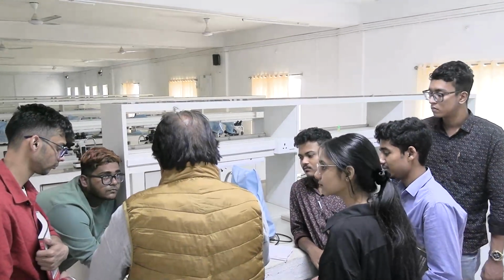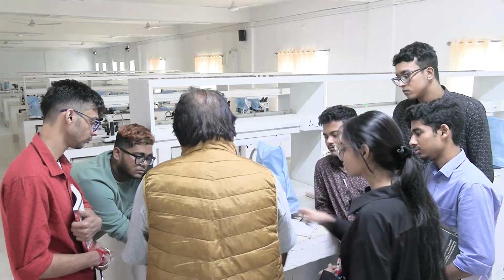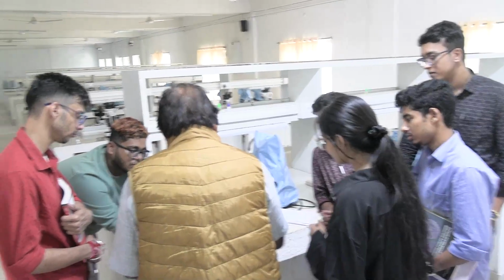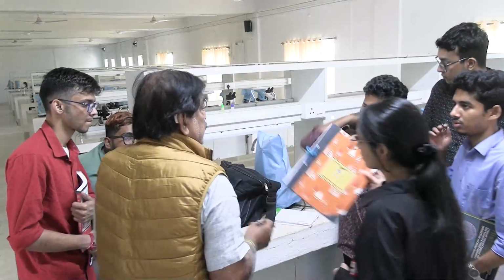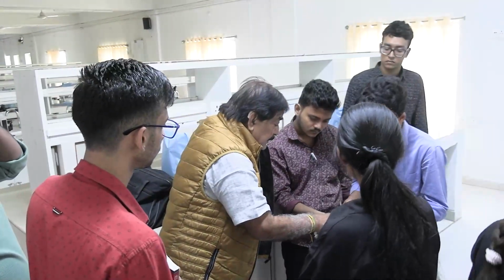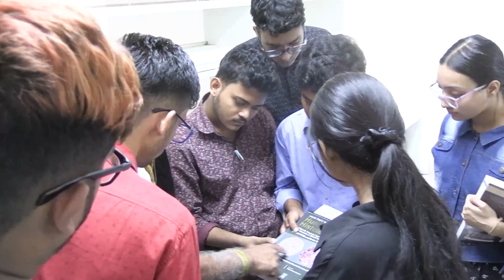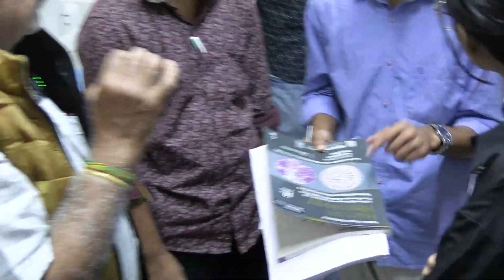If there is a very good presentation, we just put a good or something like that. তো এটা কিন্তু খুব ম্যাটার করে না, কিন্তু খাতাটা টাইমলি এরকম করে ... ঠিক আছে, ঠিক আছে। This is Indrabir Singh, এই যে ছবিটা, এটা হ্যান্ড ড্রন। ওটা একটু বেসমেন্ট মেমব্রেন এখান থেকে একটু ছেড়ে গেছে, প্রসেসিং হয় অনেক সময়। But these two slides are very well stained, very well stained.